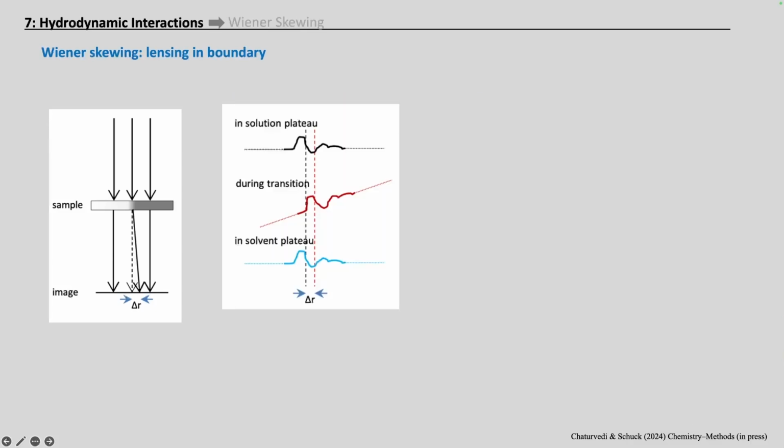What can we do? Well, the movie you've just seen already carries the seed for an experimental approach to deal with this. If you remember, the fringe profiles are always superimposed by a time-invariant baseline, which consists of adventitious blips and ripples stemming from imperfections of the optical elements on the nanometer scale. We can fit these constant signal profiles and usually forget about them. Compared to the signals from concentrated protein solutions, this TI noise is typically 1,000-fold smaller.